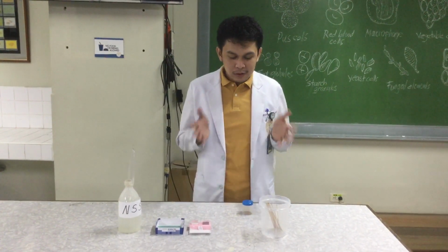Okay, so we are done with the use and care of microscope. For today, I'm going to discuss the fecal smear preparation and also the parasitic amoeba. So let's start with the fecal smear preparation.